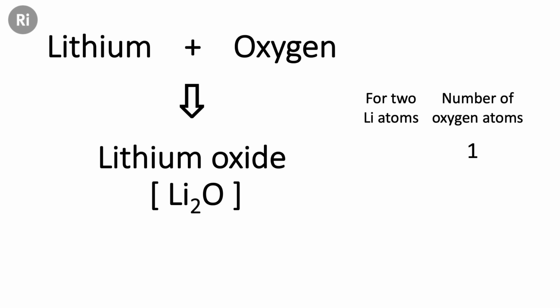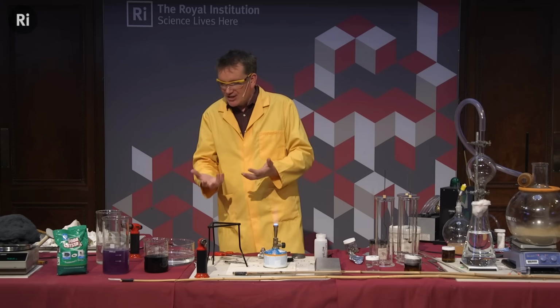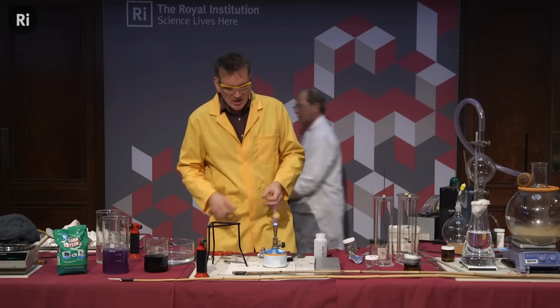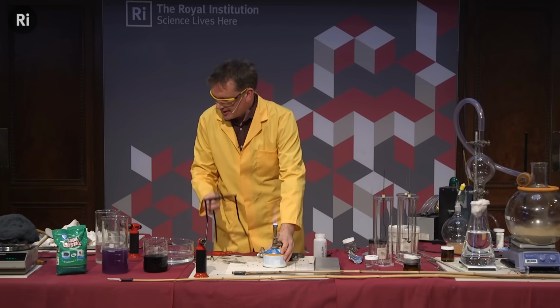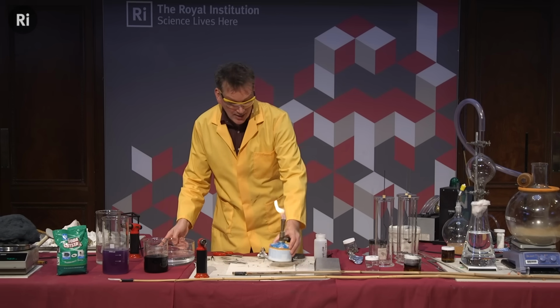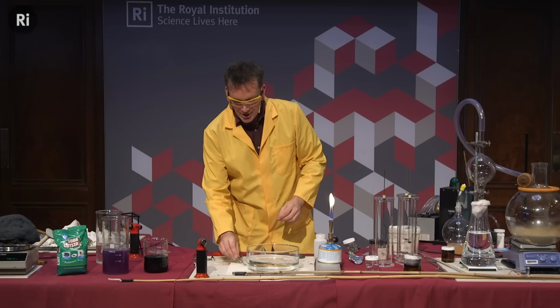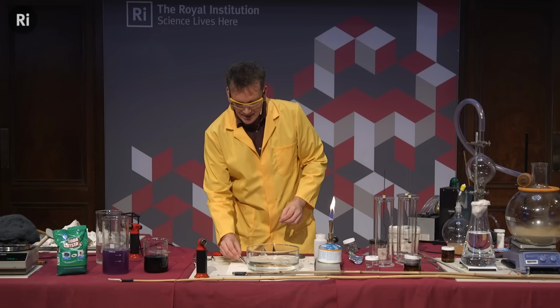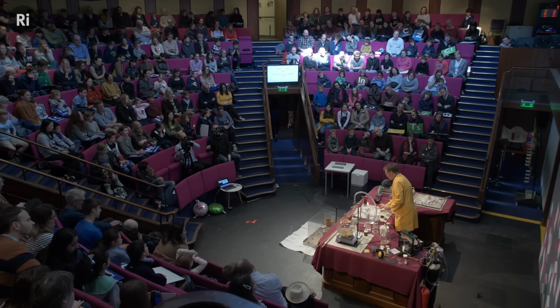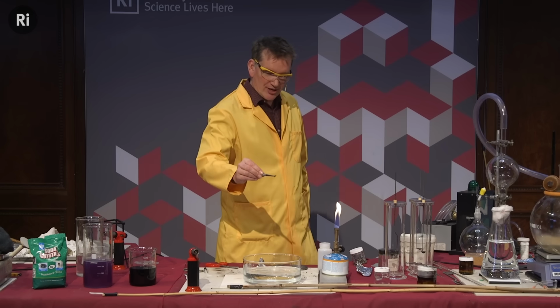Okay, if I dissolved some of that smoke in water, it is also an alkali. It easily dissolves. It's the opposite of an acid. But I can make that same alkali by reacting some of the lithium metal with water. And this is what I shall show you now. So remember, I snipped off an extra little piece here. So I'm just going to add this to the water. And we can see some interesting things. So let's add this to the water.